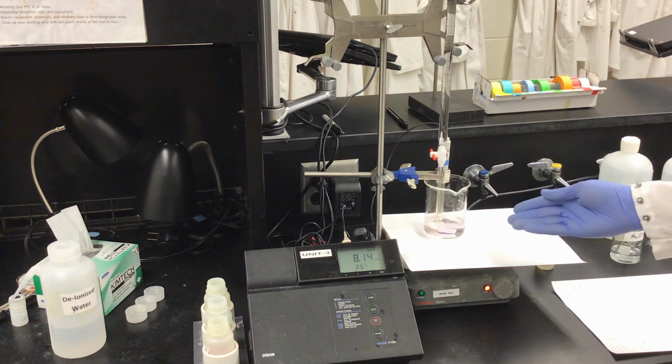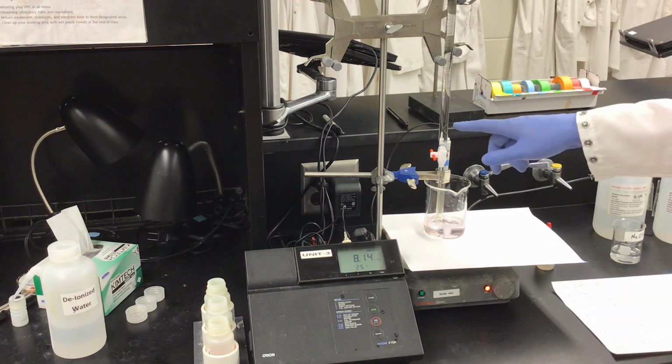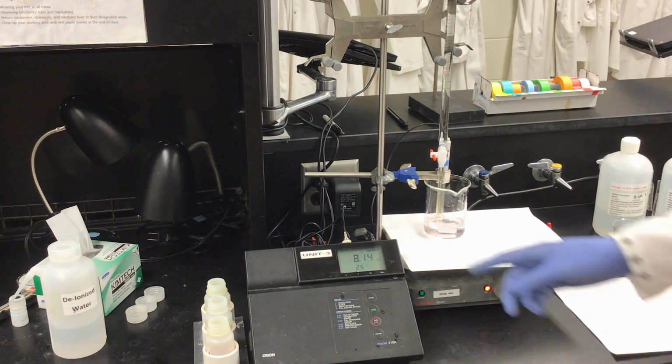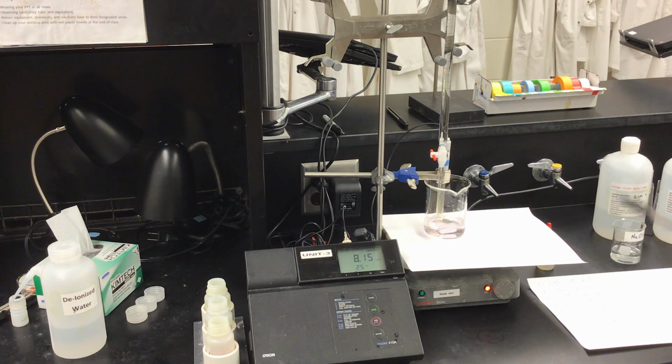So now that we have hit our endpoint, we're actually going to continue adding sodium hydroxide until we have added 50 milliliters of sodium hydroxide to our solution. We will be measuring pH every 2 milliliters now. We have recorded our 25.2 milliliters as our endpoint. So now we will see what happens when you over titrate the solution.